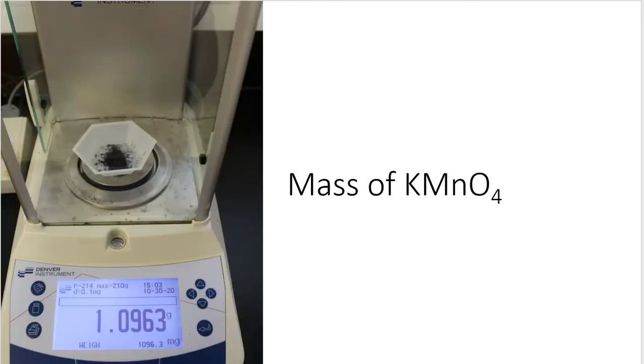All right, so here's the balance, and I've put some KMnO4 on it. The mass that I have weighed out is 1.0963. Again, we need 2%. Hopefully I did the calculation the right way. If not, you can check me. That's a part of the lab procedure.